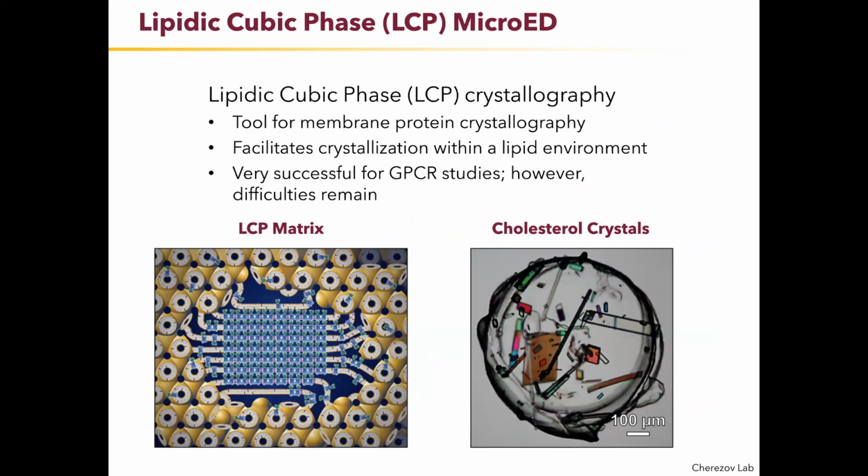So the first example is kind of a joint section where we're going to talk about an example of how you solve proteins by MicroED, but also where some of the method development is going in MicroED. And that's this particular project that's going on in our lab in collaboration with Wei Liu here at Arizona State, and also Tamir Gonen, my old postdoc advisor who's now at UCLA.